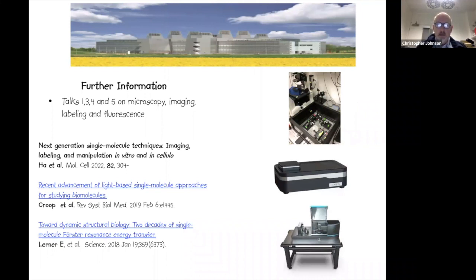Okay. With the C-trap system we got for the LMB, what kind of protein DNA interaction experiments could we do?